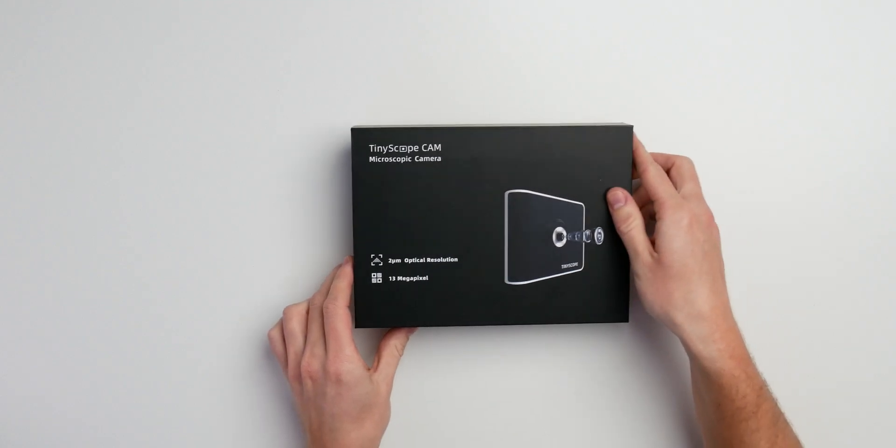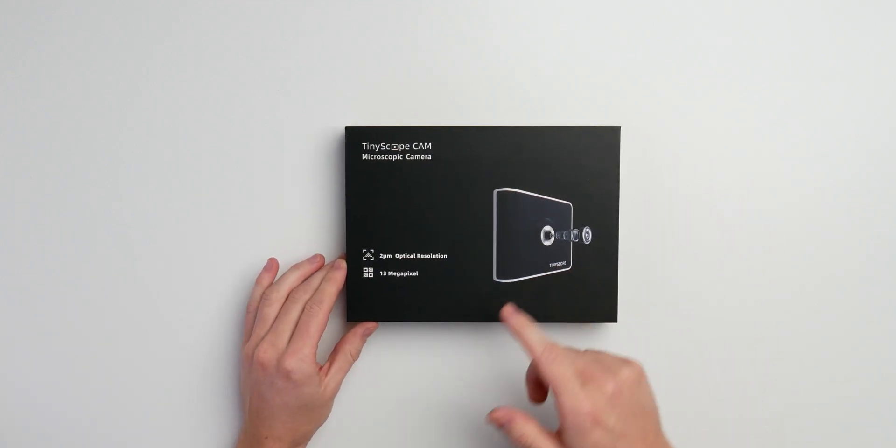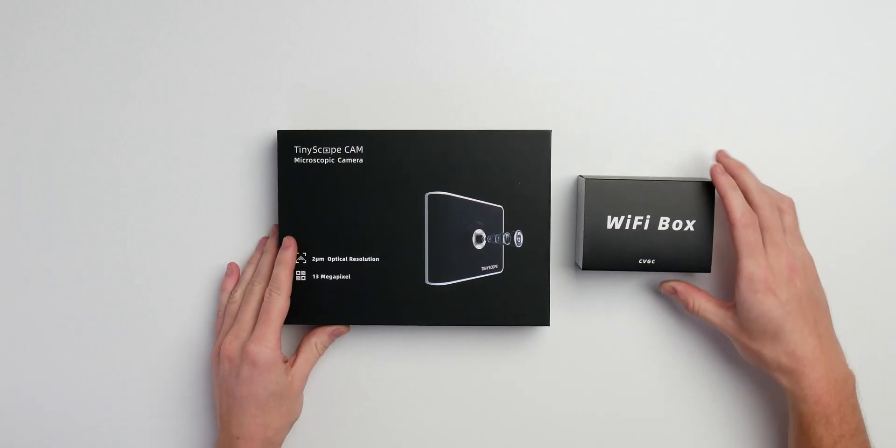And as always we just first start with a little unboxing. I already took a look inside of here I must be honest. So it's pretty unique and pretty cool. We just get this complete standalone device here and you also need this WiFi box. This WiFi box is just handy and cool because this camera is driven and powered by your smartphone when you have an Android smartphone because it can just use the OTG mode. But if you have an iPhone like I have you just need this little WiFi box which on one hand powers the camera and on the other side also accesses the WiFi hotspot. You can just access and have remote control of everything. Pretty cool so at the same time you don't need to fiddle around with a camera, and especially with the microscope where just a little shakes can ruin the complete result, I think the WiFi box is just pretty cool.